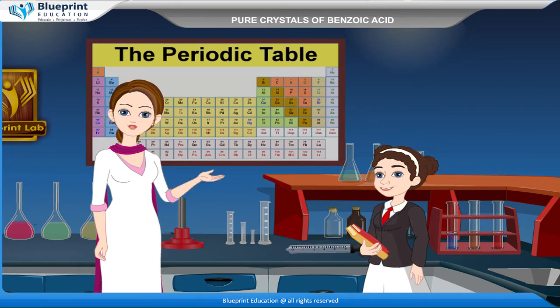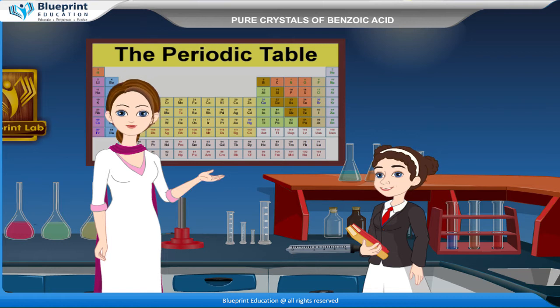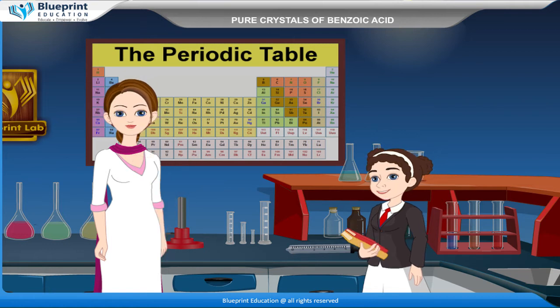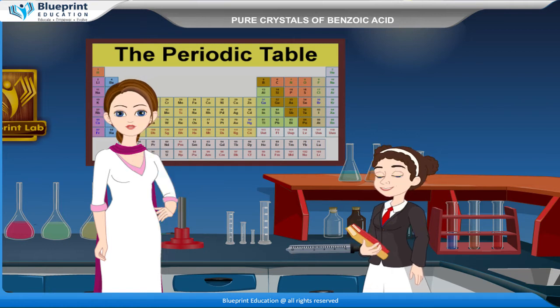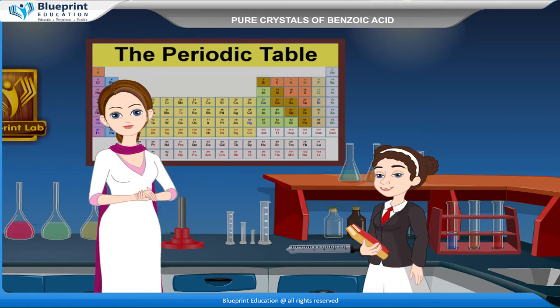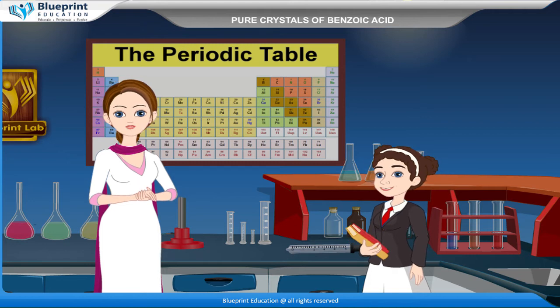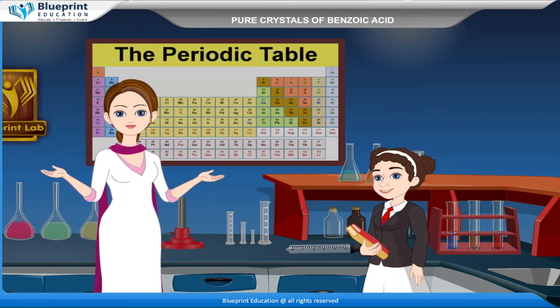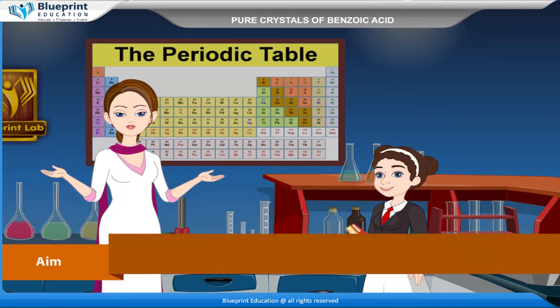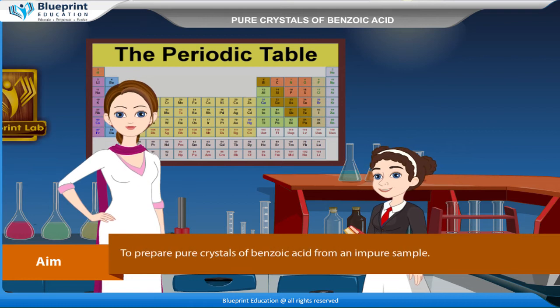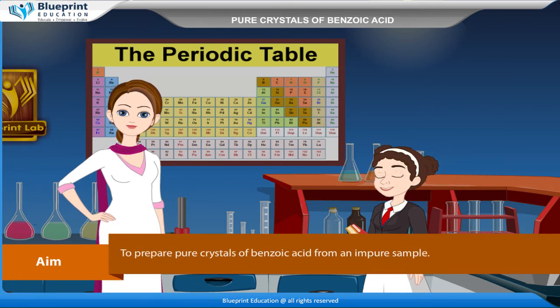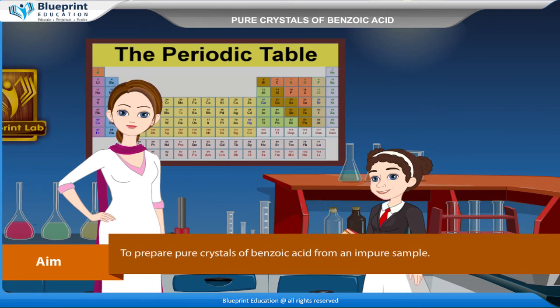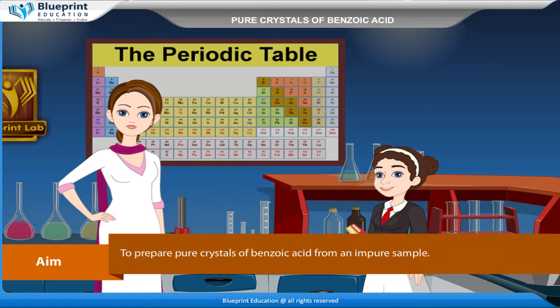C6H5COOH, or benzoic acid. Our aim here is to prepare pure crystals of benzoic acid from an impure sample.